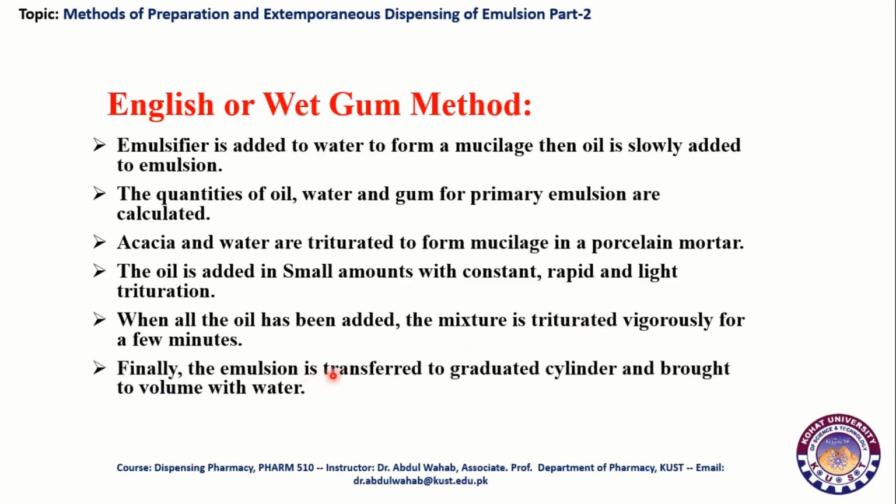Finally, the emulsion is transferred to a graduated cylinder or a suitable container and brought to volume with water. The final volume must be made with the help of water. It means that we should add further water to make the final volume.